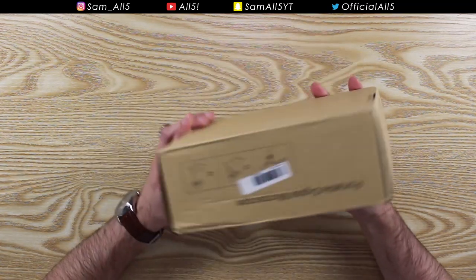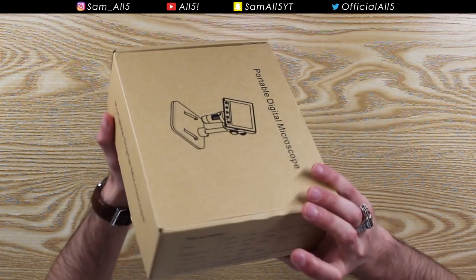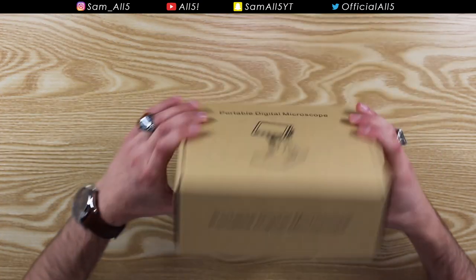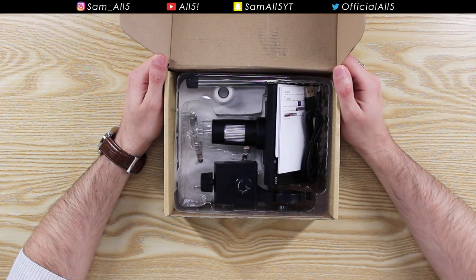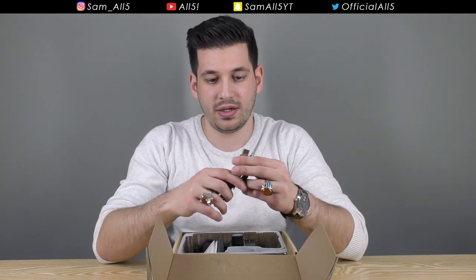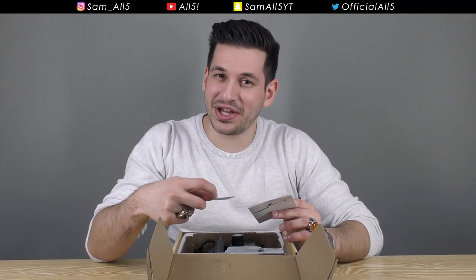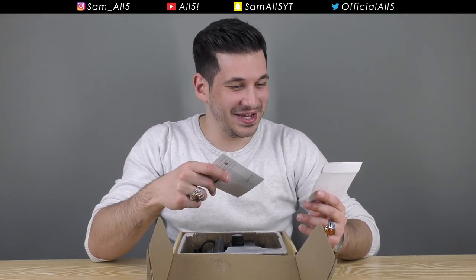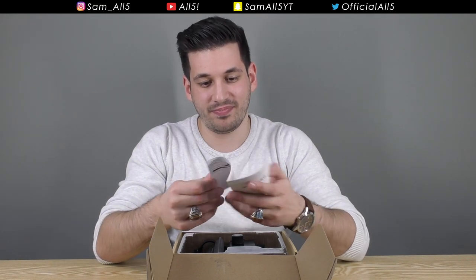The box itself is pretty plain — not much on it, really basic. There's not even a brand name on the box, so this is completely unbranded. Let's crack it open. You get a USB cable, so I'm assuming that's to plug into your computer or laptop. You also get a CD-ROM — wow, that's how you know it's old school when they're still dishing out CDs.